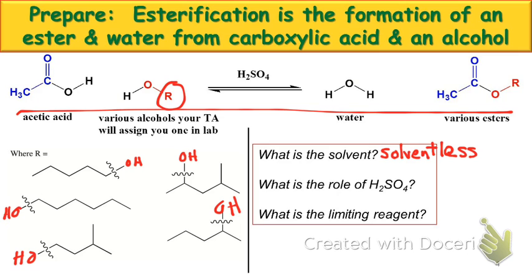Okay, I'm pretty sure, and you need to check your reaction or your conditions just to make sure, it's the one that's in there in the largest concentration. Oh, thought that no was at me. Okay, so yeah, that's the one that's in there in your largest concentration. That one can act as our solvent if we're forced to call it that.